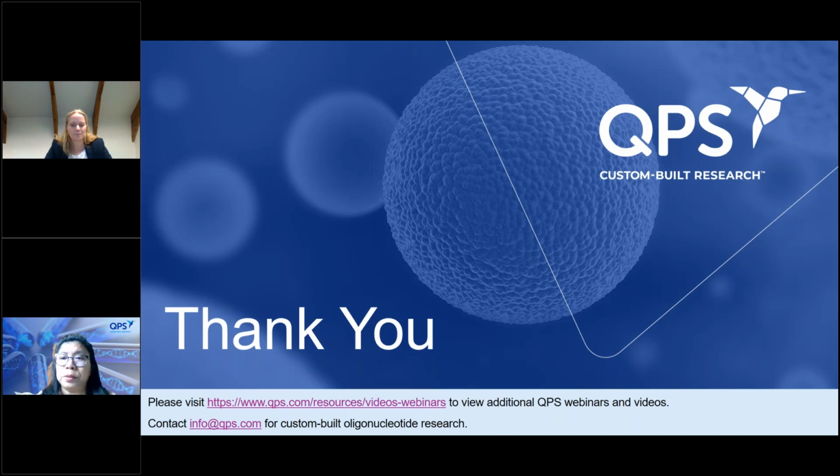And would you happen to know what the dilution factor was for the eye homogenate that you had tested? So for the whole eye homogenate, I think it was 20 from the top of my mind. For the individual eye tissue samples, it ranges from 10 to 20. So yeah, it's all in the same range.